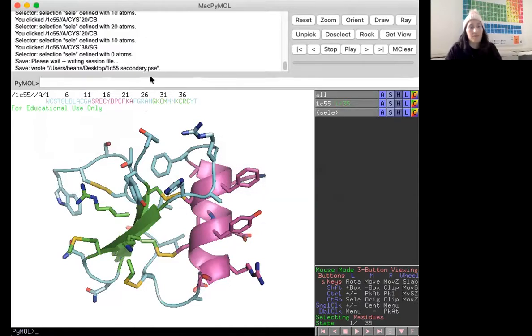And save. Now, what happens is maybe your computer might crash, right? Well, let me just back up. We did a lot of work to get to this point of this image that I liked, that I think is good. And so we don't want to have to open up PyMOL and start over from scratch again. So that's what saving the session is going to do. It saves all this work. And once you close this program, you can reopen your session and it brings you right to this point exactly. All these color schemes, this layout, this orientation, whatever you save the session as.